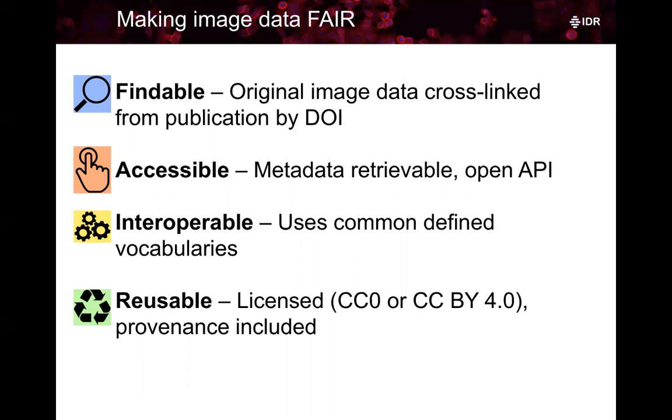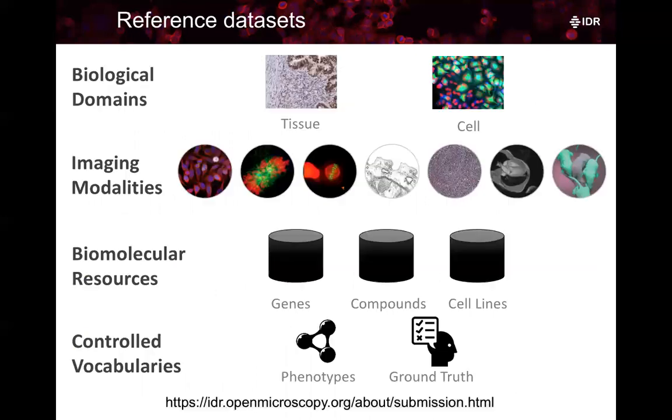But which datasets should IDR make FAIR? Unfortunately, we can't do this with all datasets as it's a time-intensive process. We have therefore chosen to focus on reference datasets submitted by the community. This means we look for valuable images from each domain that either have links to existing resources or where we can help to establish those links.